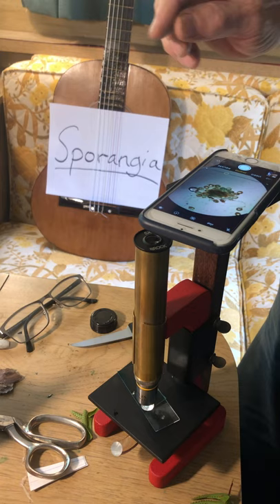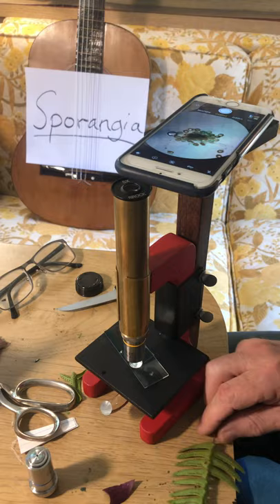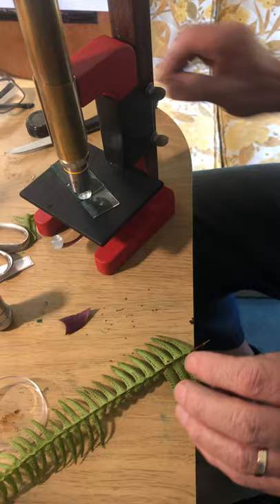And you can see what we're looking at here at that power. In order to see the spores, which are little tiny things, you'd have to go to 400x, which would be the longer lens — and that's a separate lesson unto itself. This lens right here — we'd have to teach you that separately. But what I want to show you is how to spot the mature leaf.